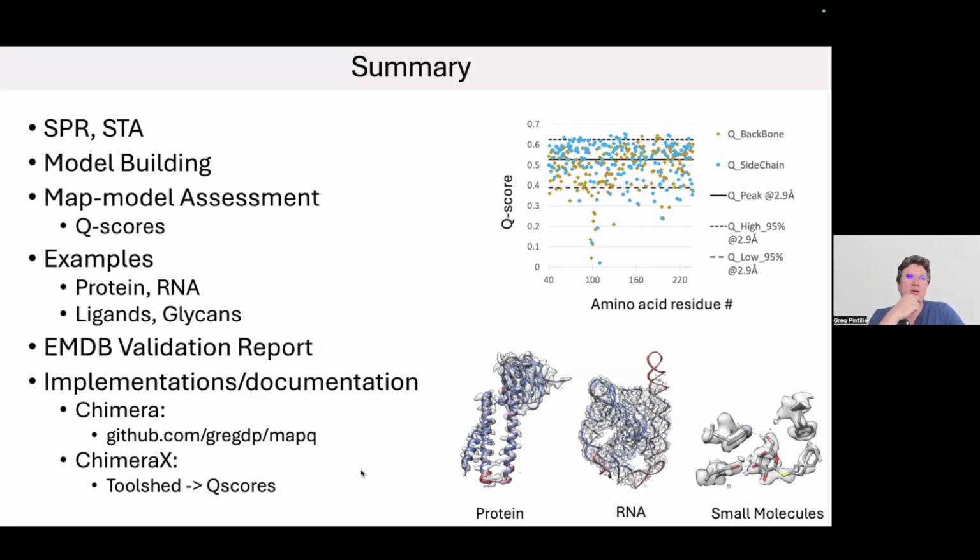But you might try optimizing how much noise you see versus how many atoms are inside the contour level. You might try to decrease the contour level to include as many atoms as possible while not adding too much noise. You'll notice as you lower the contour more and more, all of this background noise starts to appear. Visually, that's what we do: we decrease it as low as we can, and when we start to see too much noise appear, we stop. That's the ad hoc method, but I don't know of any methods to do it automatically.